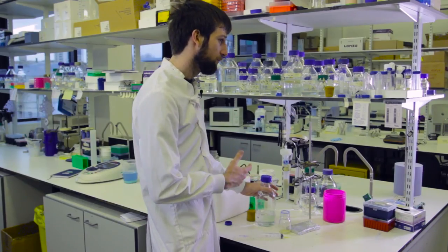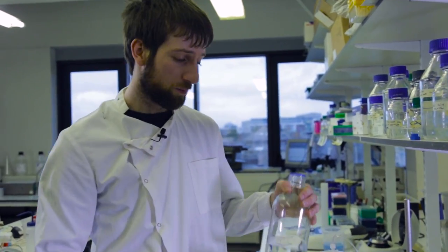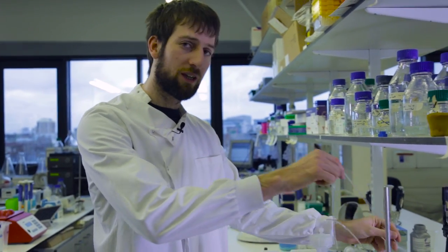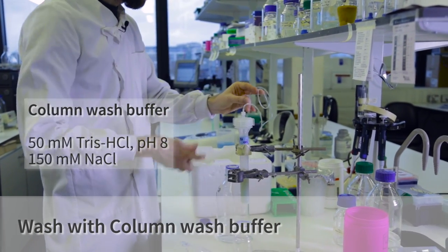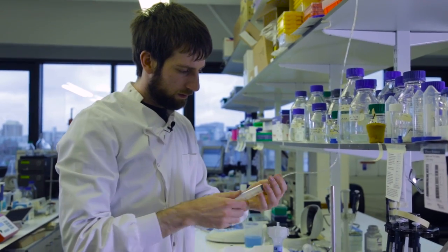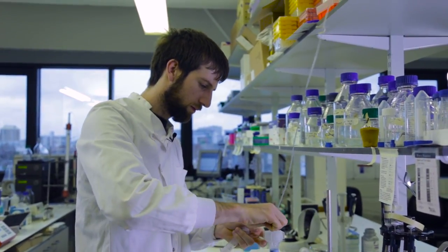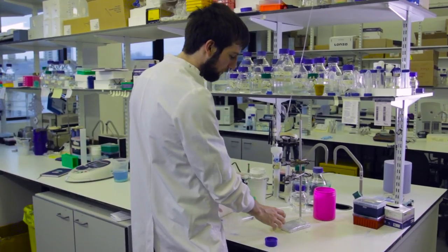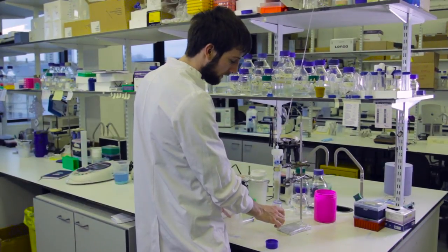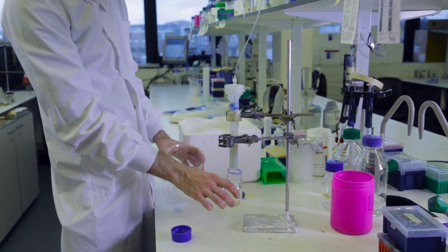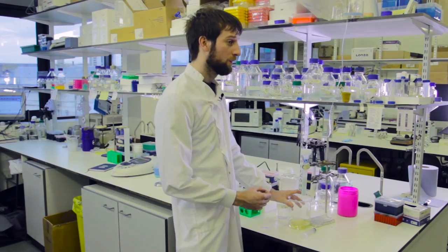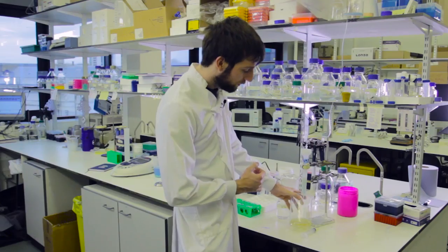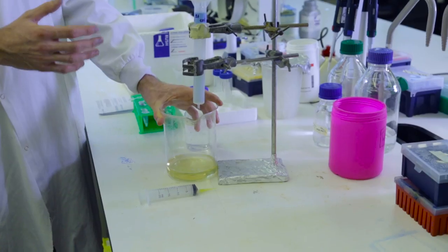We also need to wash off any protein that's just sort of sat on the column rather than specifically bound, and we do that using the column wash buffer, which contains some salts and some buffering agents to keep the proteins in solution. We'll collect a little bit more of the flow-through just to make sure nothing's left behind, and then switch to our wash beaker. The wash buffer has come through. The column is now completely washed, removing any non-specifically bound protein from the column.